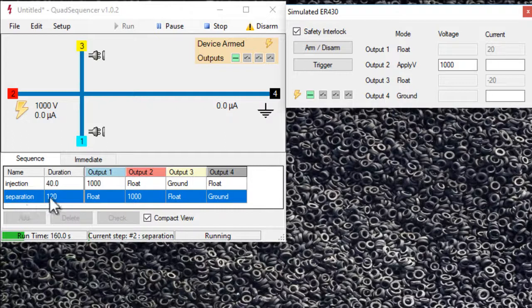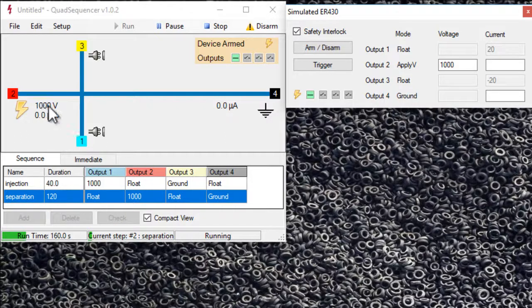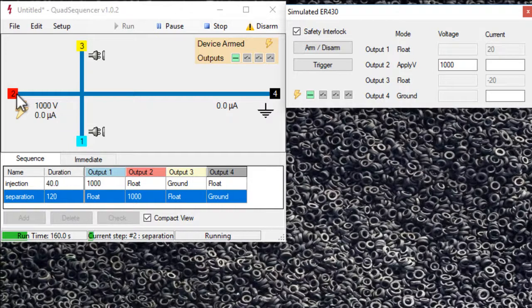So for 120 seconds, it's going to apply a thousand volts to reservoir two and ground to reservoir four. Now again, there'd be a current flowing here.